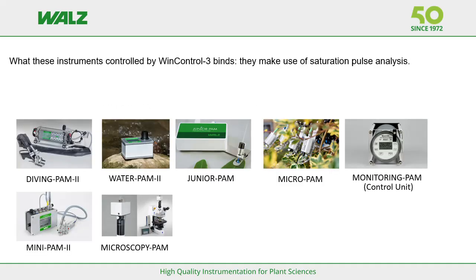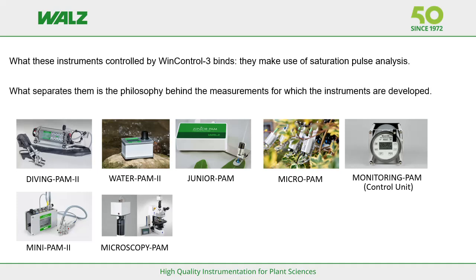Looking at the 7 different instruments, I want to note that what binds these 7 instruments is that they all use the saturation pulse method. What separates them is their application philosophy, the application for which they were developed. Again, I want to emphasize that I will use the MINI-PAM-II as reference instrument for my presentation.